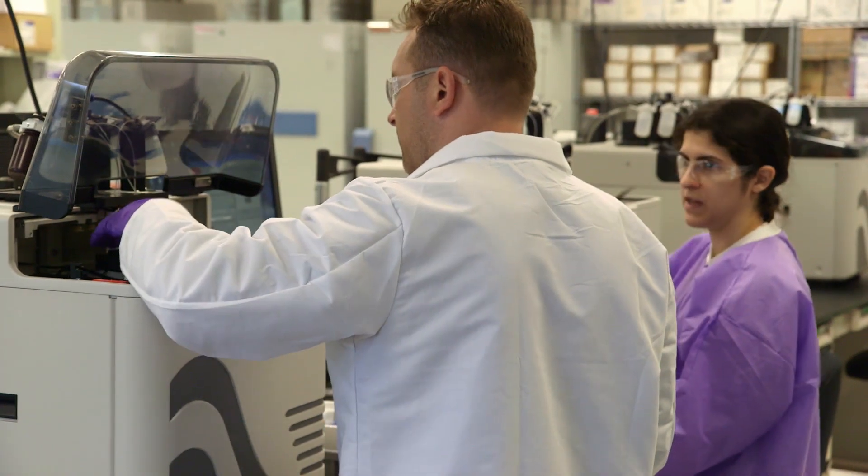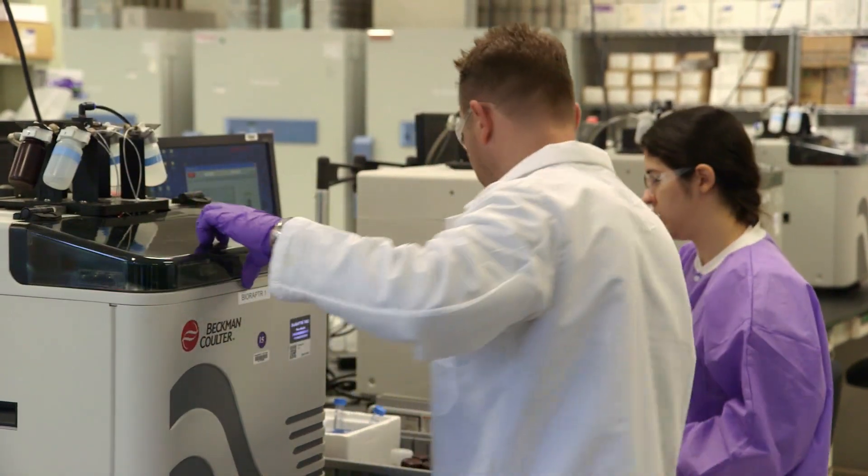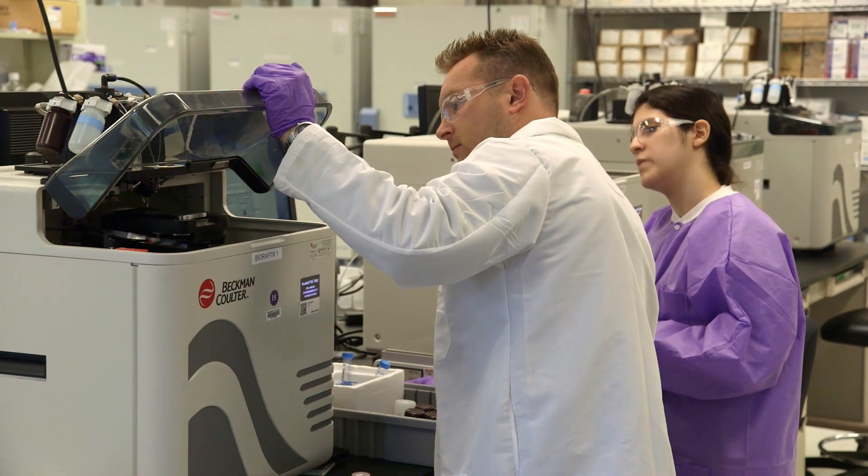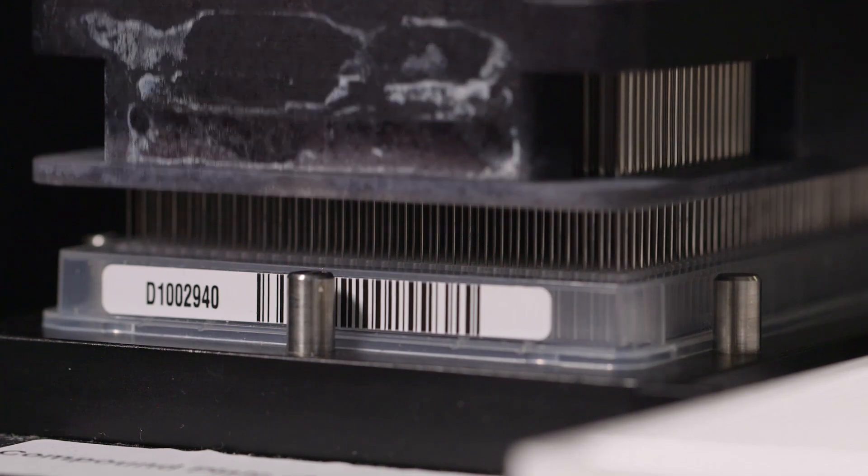Biologists first try out a new assay by conducting small-scale tests, using compounds with known activities to see if they can be detected. If successful, a larger-scale test of the assay, using a few thousand compounds, is performed.